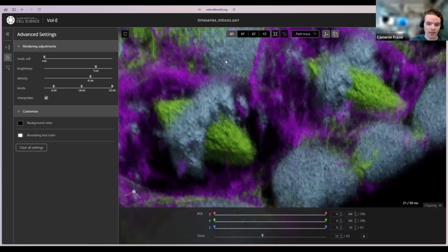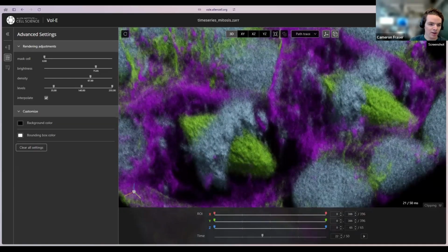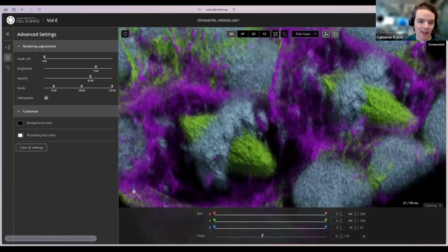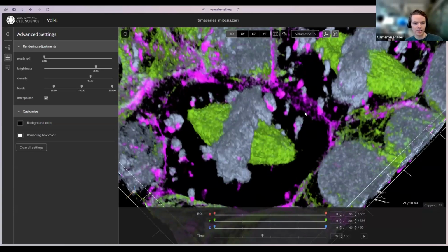The final thing I want to show off for today, besides, let's see, I have the option here to take a screenshot once I've really dialed in these settings and let the samples of this rendering algorithm accumulate. Can download a screenshot if I want. As well, let's say I go back to volumetric, and maybe I've dialed in some setting exactly how I want in order to reveal some interesting feature of the volume.